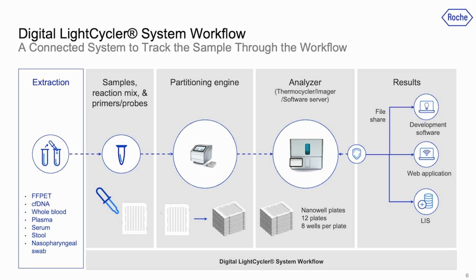Once the nanowell plate has been loaded, it is then partitioned within the standalone partitioning engine, which also scans the nanowell plate and monitors the partitioning process. There's tracking throughout this workflow, also looking at it from the perspective of the system level. Once the nanowell plate has been loaded and partitioned, then it is placed onto the analyzer itself.